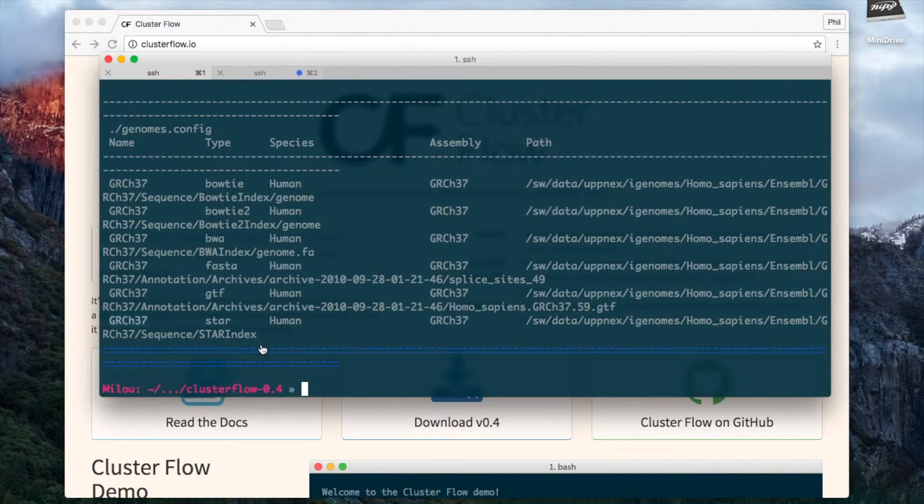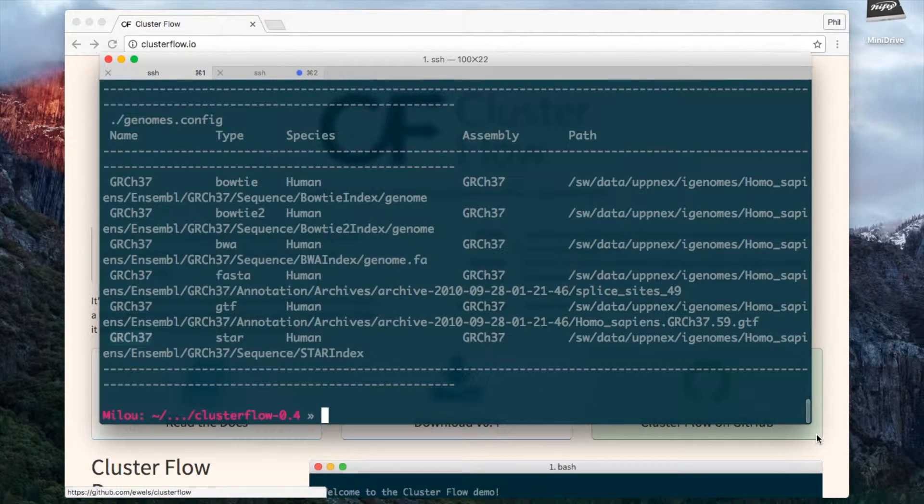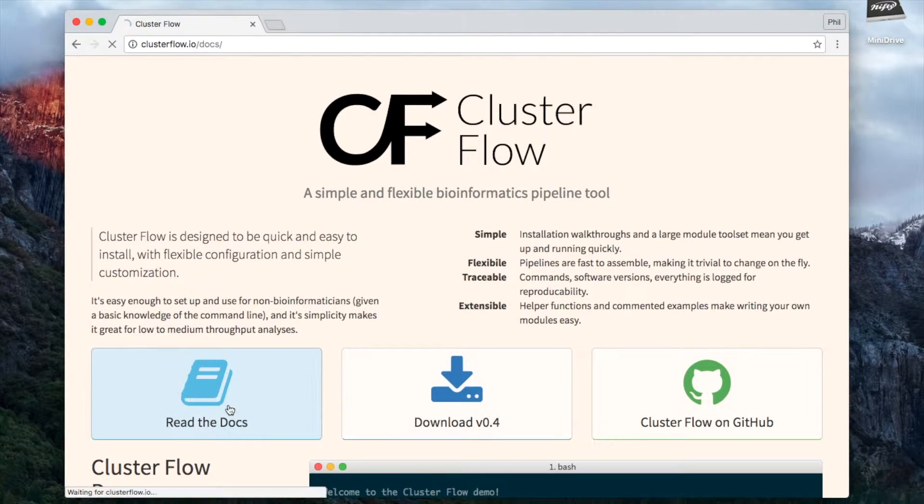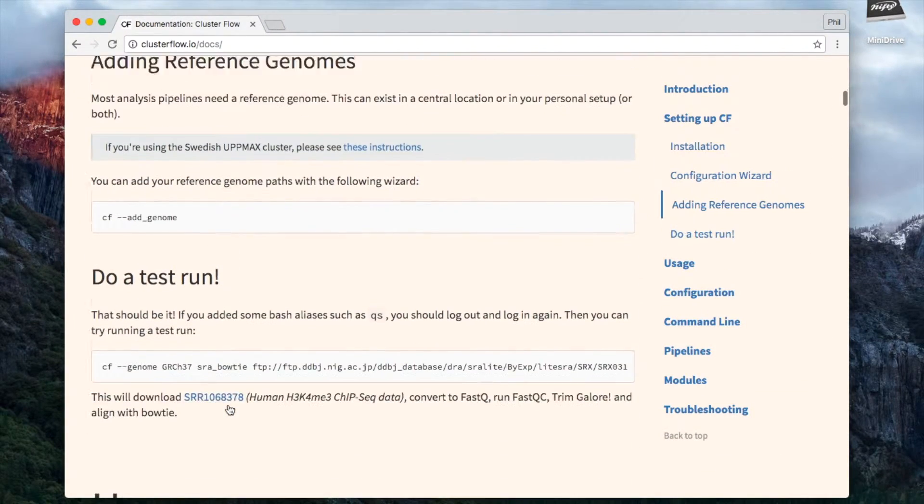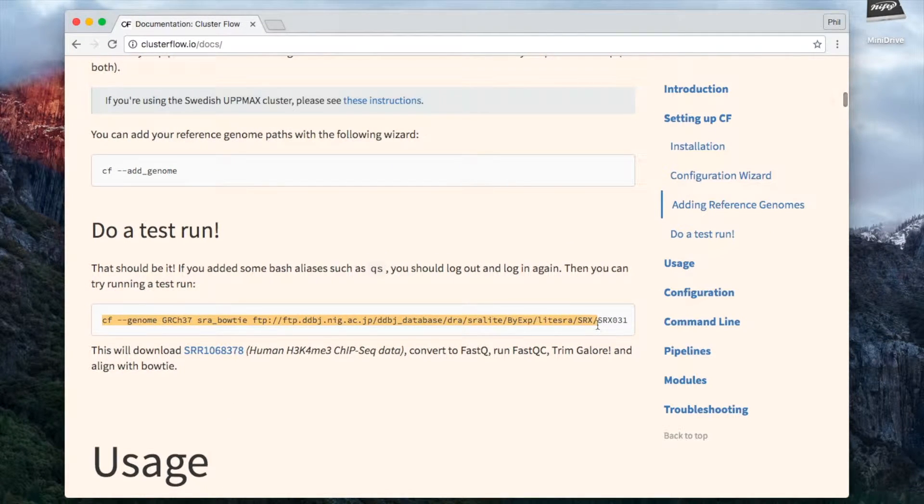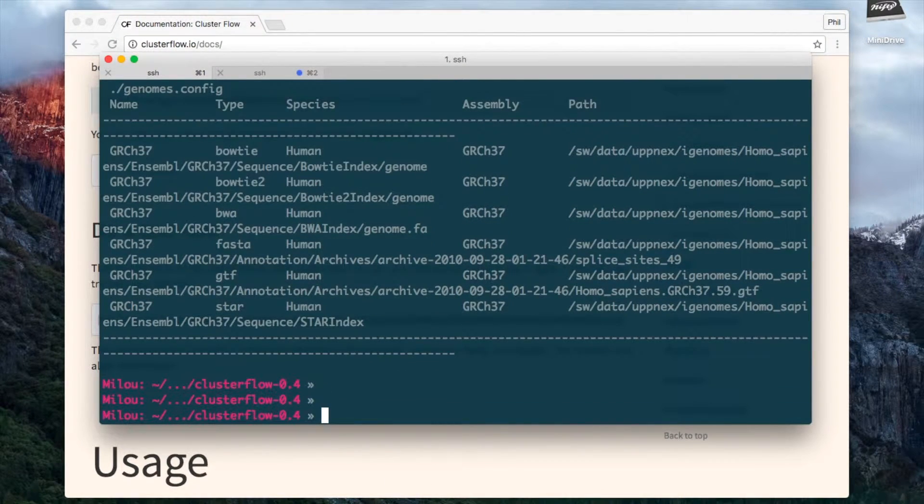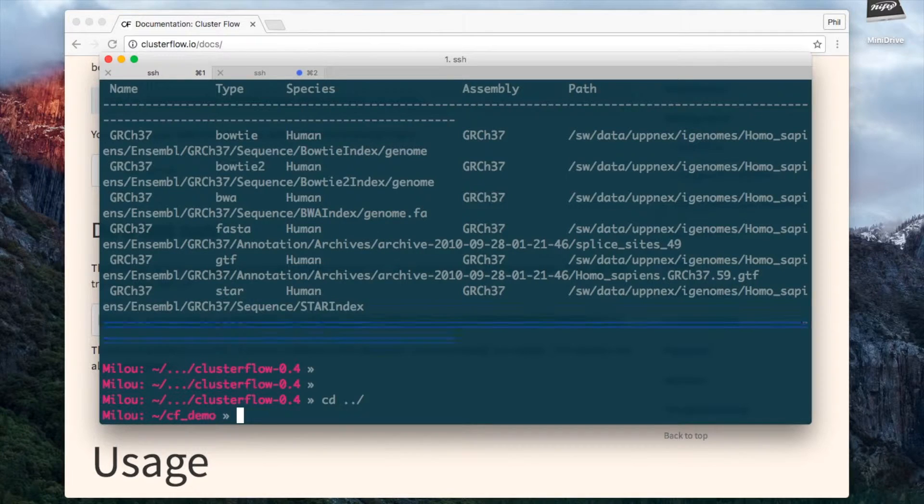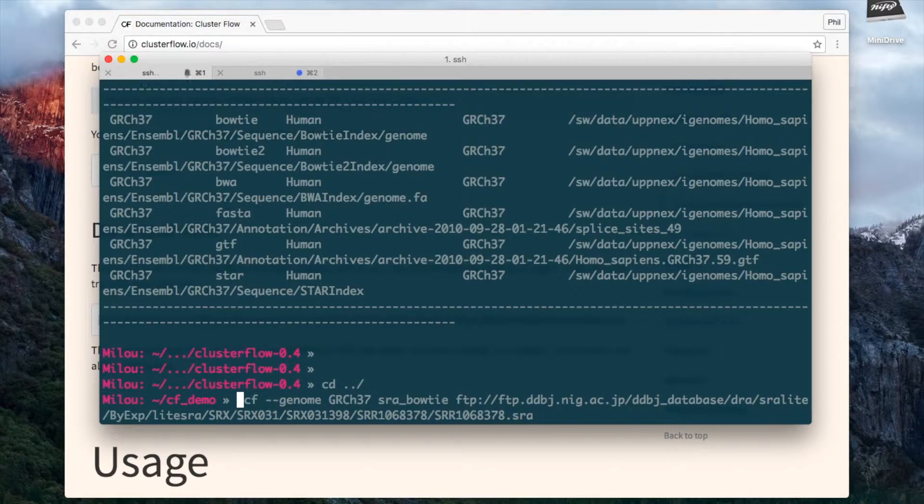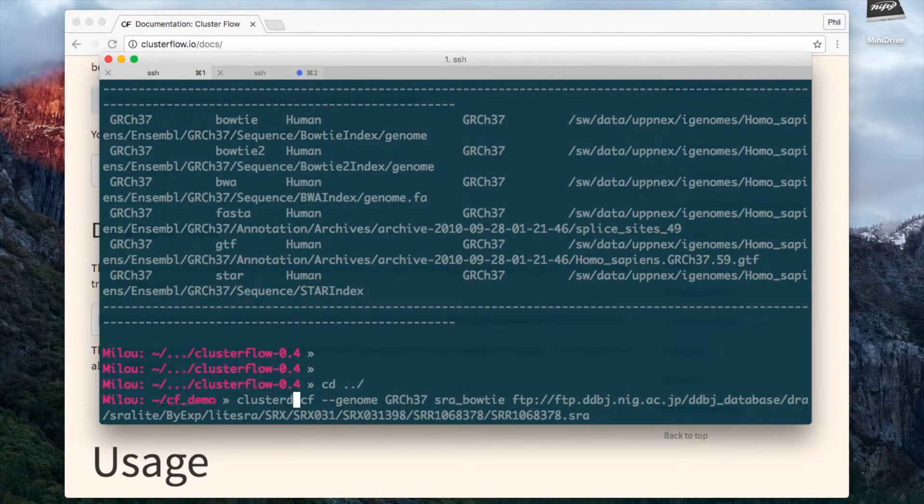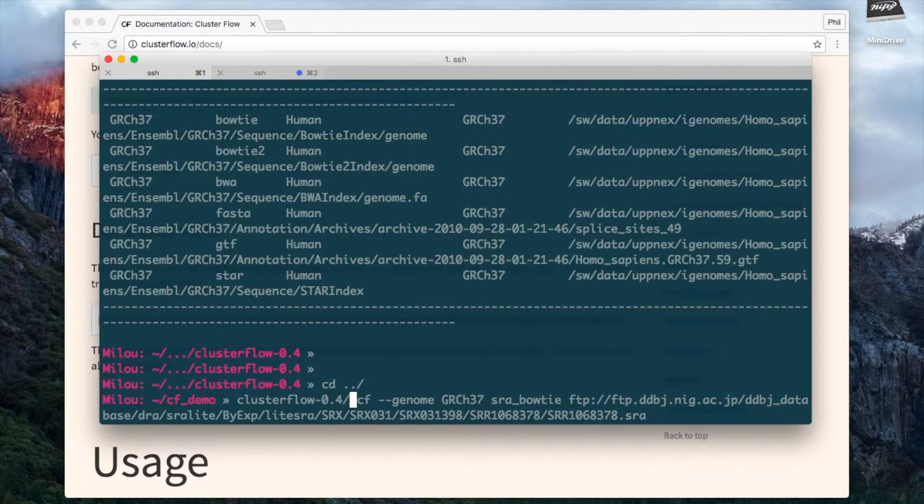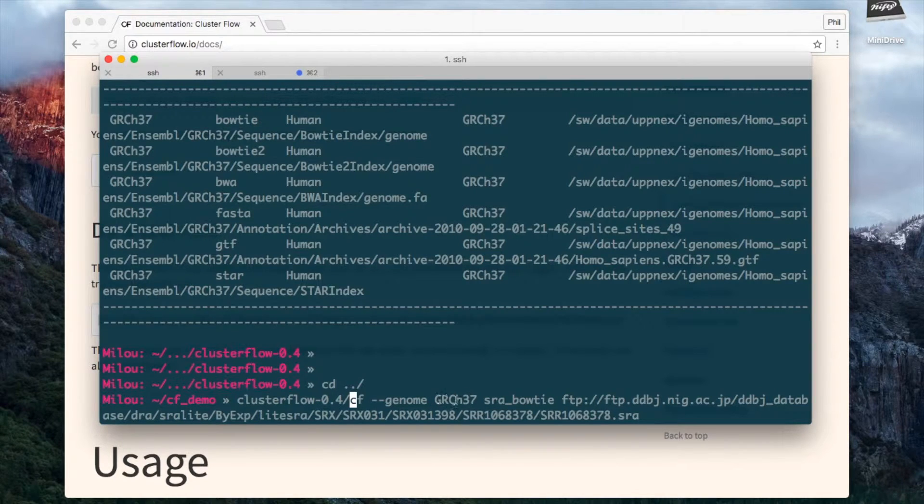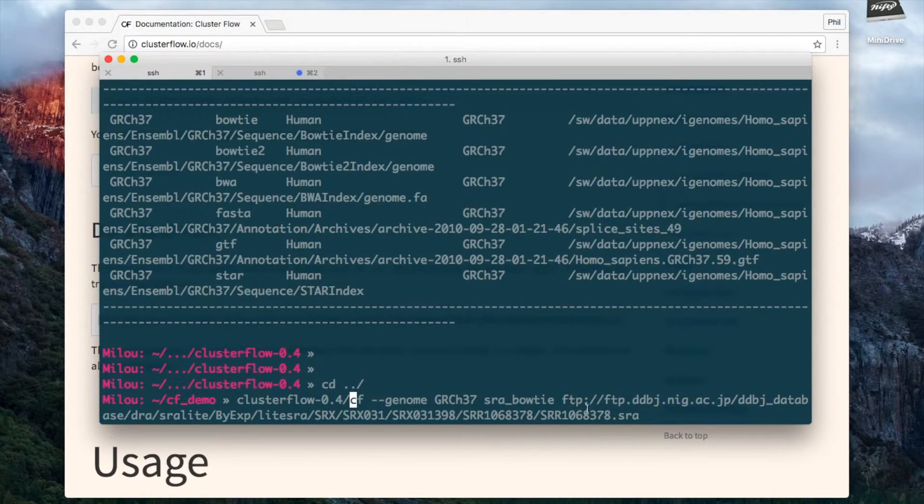I think I've just about done everything now so I'm going to run a test analysis just by downloading and analyzing some example DNA, some example sample. You can see it says cf --genome. So I first specify Clusterflow and I do --genome with the genome I've just set up. This is the name of one of the pipelines that comes with Clusterflow and then this is an SRA file which is publicly available.